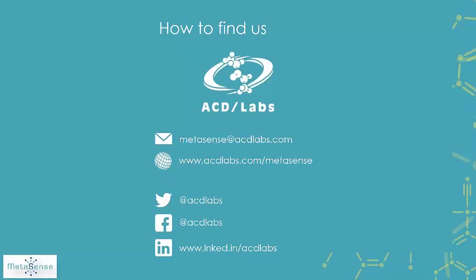So if you already have Spectrus Processor deployed within your organization and you're using MetaSense already, the only thing that's required is the Spectrus DB Enterprise server, as well as an Oracle DB server from your IT department, so that you can communicate your results that are generated through MetaSense to the rest of the organization. So it's a fairly easy deployment to do, so it's not very laborious at all.